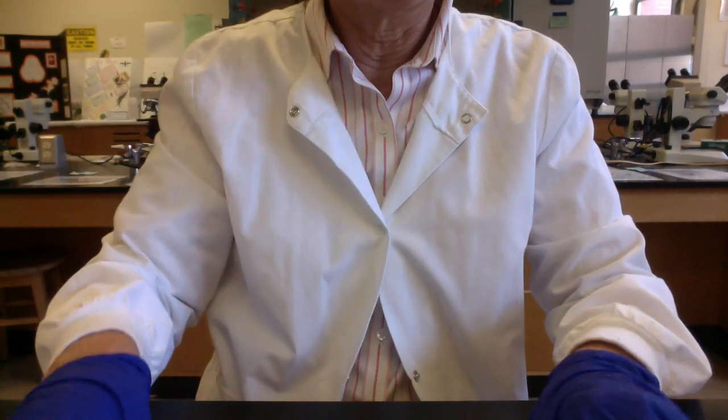What I'll try to do today is make a few videos of the things we would be working with in the lab. And then when I'm at home, I'll pull up our lab manual and walk over some of the details. This is going to be mostly for visuals. The reason is we've been told that starting next Tuesday we can't come onto campus, we can't come into our labs, we can't come into our offices. So this is going to make it a little bit more challenging, but we can do it.